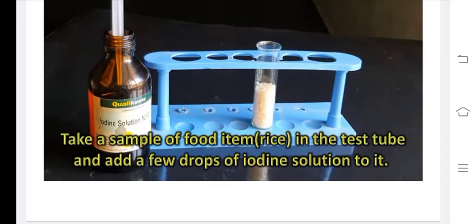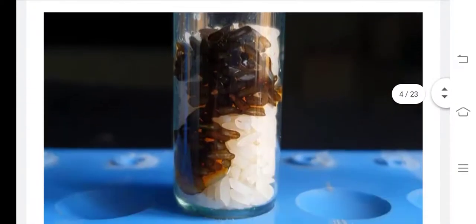I told you once again, in order to conduct any experiment, we have to follow three methods. One is procedure. Now what I am saying, this is the procedure step. Take a sample of food item in the test tube and add a few drops of iodine solution. Next step is observation. We have to observe. Okay, clear. This is the rice, no? What are they adding?